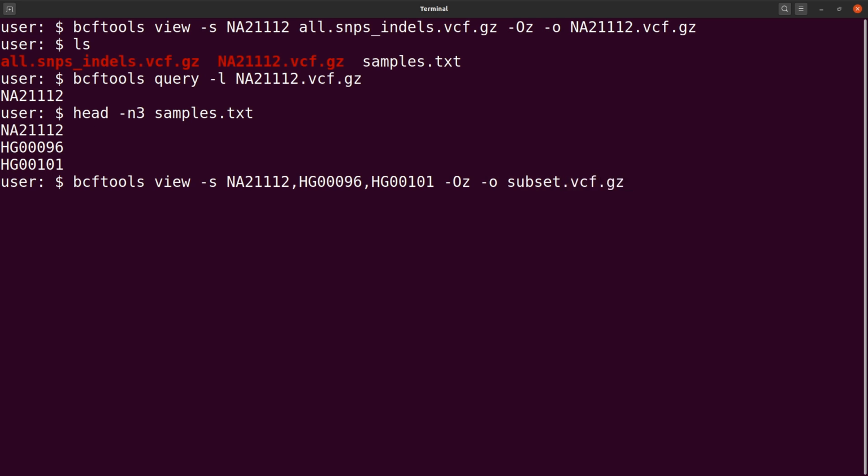If you have a different name too, you can just use that, but I'll just say subset.vcf.gz. So I have it here, and then I specify the original VCF file where we want to do the subsets from. So all.snips like this. And so once we have it like this, we just execute. And then it is also done for you nicely.